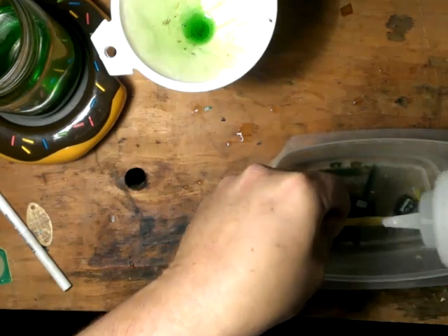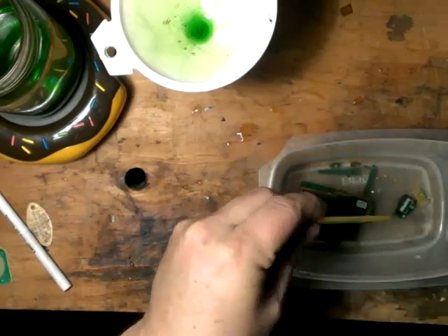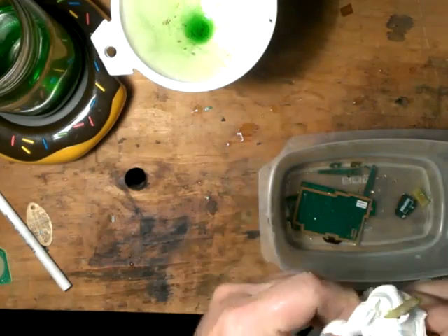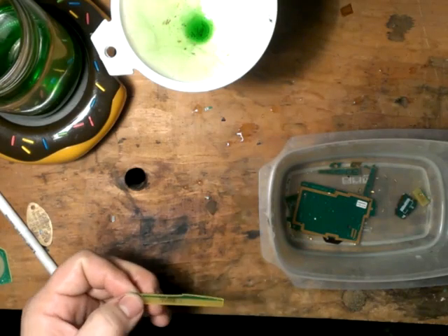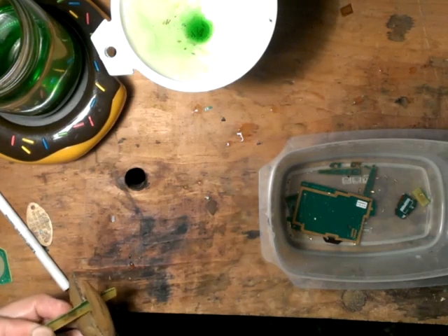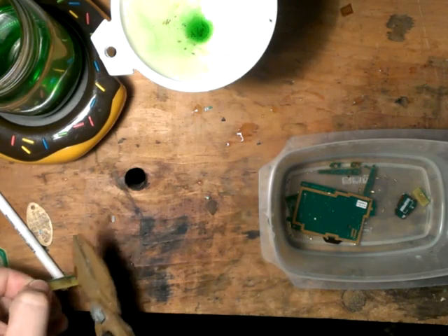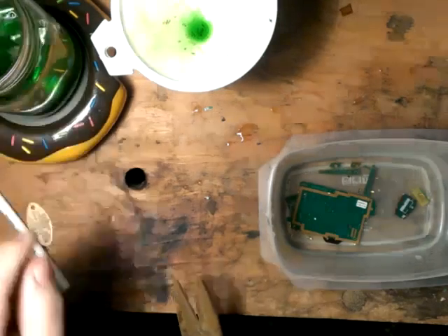Nope, not quite ready yet. It's stuck on there pretty good. We will do what we've done before — dry this off a little bit, trim it down. You don't need the whole thing there, obviously. Gold is gone. Trim that down. Back in our liquid.